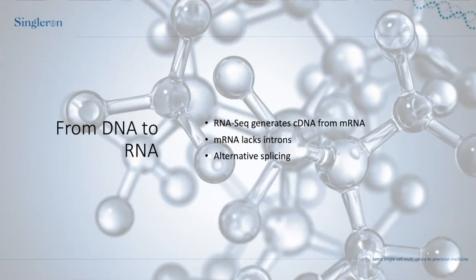But I will just say that when you are working with RNA sequencing, you now have one additional layer of complexity in that you are working with cDNA, which lacks introns. Because of splicing, if you try to match to a genome, you might have the condition where one part of your read matches to one exon and the other part of the read matches to the next exon, which are usually in the reference genome separated by a large intron, which does not exist here.